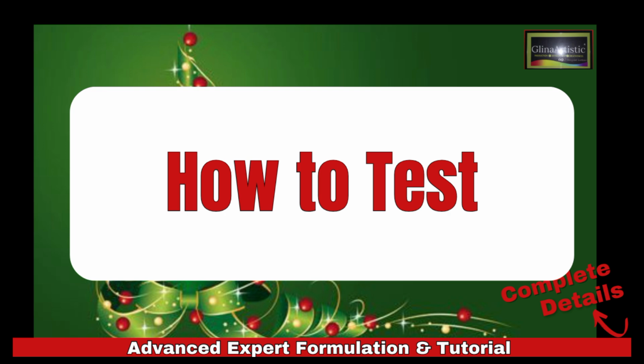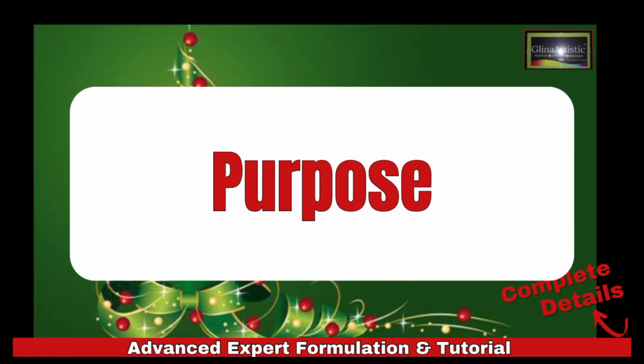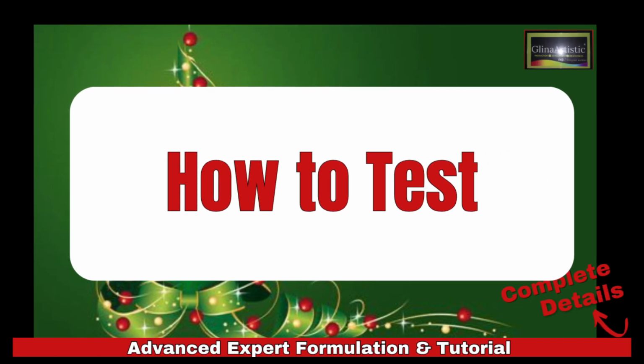As simple as that. And for the gloss and shine test, you have to evaluate the paint's reflective properties. So how do you do that? Use a gloss meter to measure the gloss level at different angles. If you don't have a gloss meter, the proper way to go about it is through your eyes. When you look at the glossiness, it reflects in your eyes, and then you go to the edge of the wall, look at it, and go to the other edge of the wall. The edges of the wall would tell you properly if the gloss is standing well, rather than standing straight and looking at it.